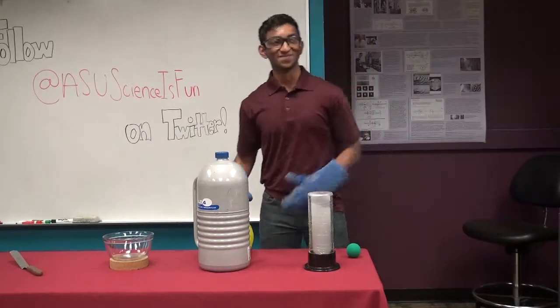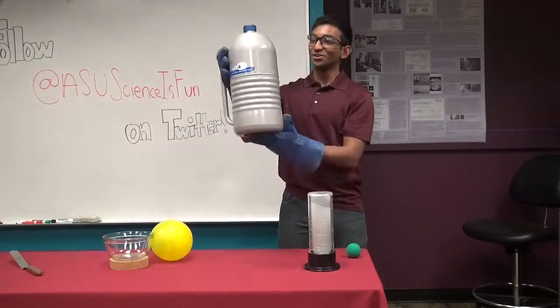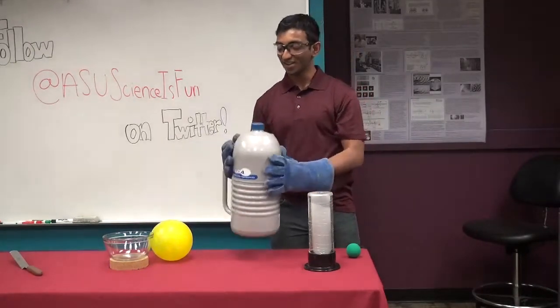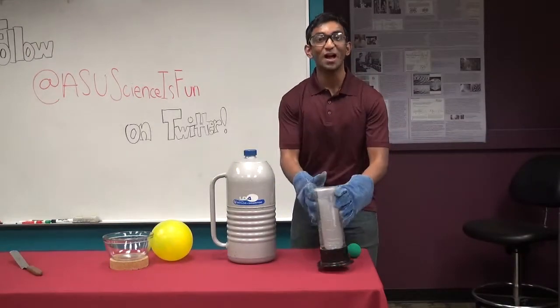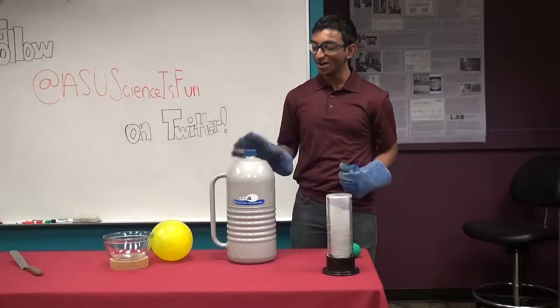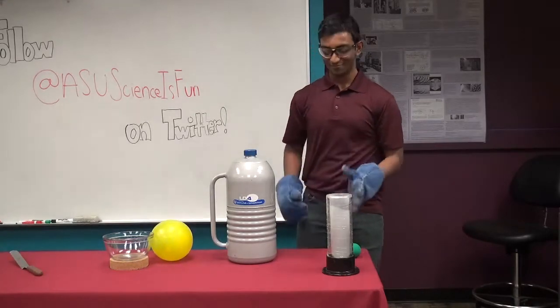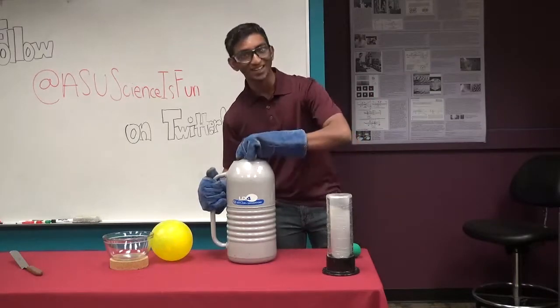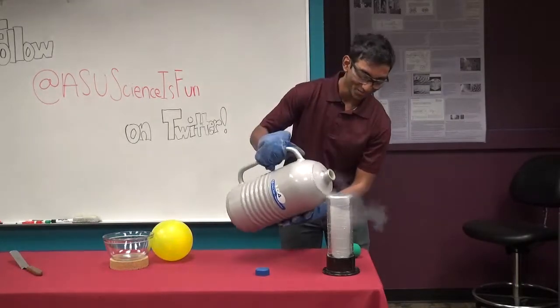Now, let's get started then. So, I have this big dewar full of liquid nitrogen. Now, this liquid nitrogen, like I mentioned earlier, is very cold. So what do you think will happen if I pour something that's very cold into this other container? It's not as cold as liquid nitrogen, so let's find out. There we go.